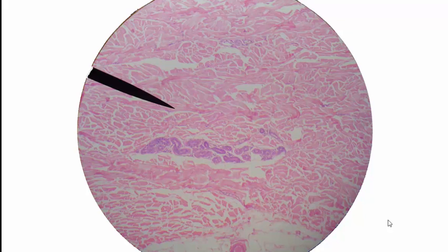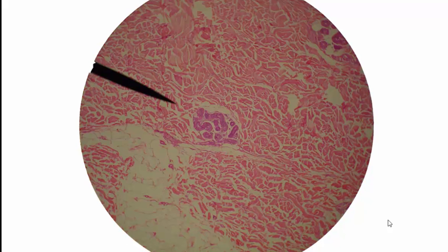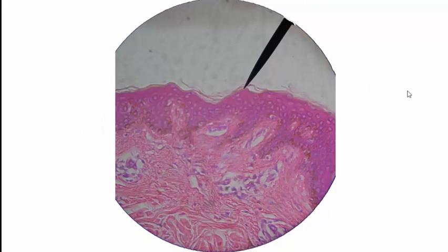That's the hypodermis. Another image here. What is this structure? The answer is sweat gland. I'm just going to randomly jump up to another picture. How about this one? What specific layer am I pointing at here?